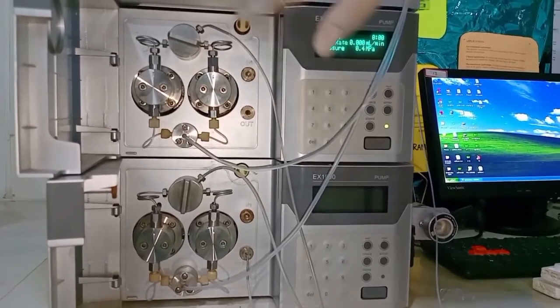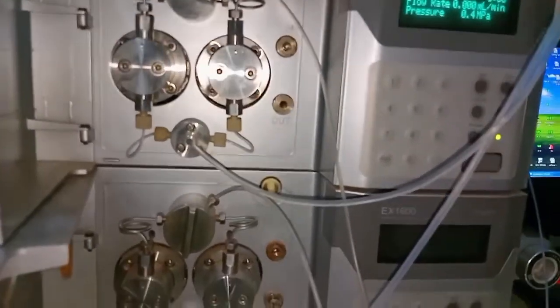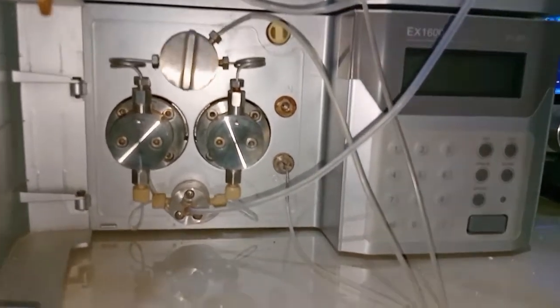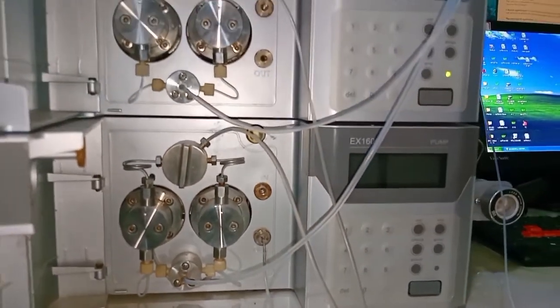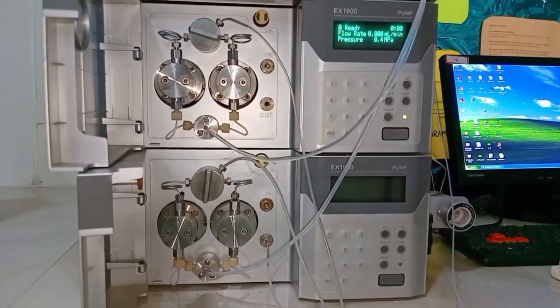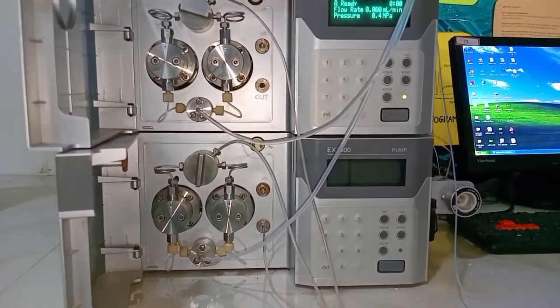In our laboratory Cyber Labs model, we have the isocratic pump. It can deliver the mobile phase only in constant ratios. The gradient pumps deliver the mobile phase in variable ratios. Generally, the flow rate of the mobile phase depends upon the mode of chromatography, that is, the analytical mode or the preparative mode of chromatography. Generally, you can use a flow rate of 1 to 2 ml of the mobile phase into the pumps.